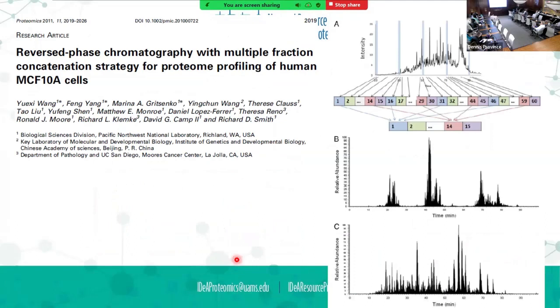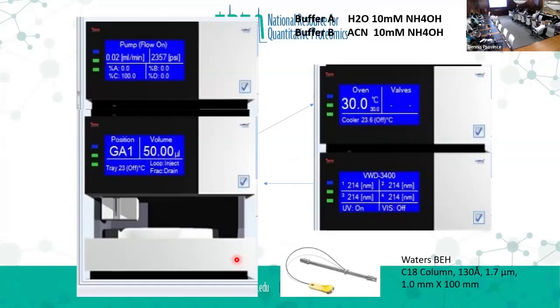And this is from Dick Smith's lab. And again, showing how you can take different fractions and recombine them and fill up the chromatogram.